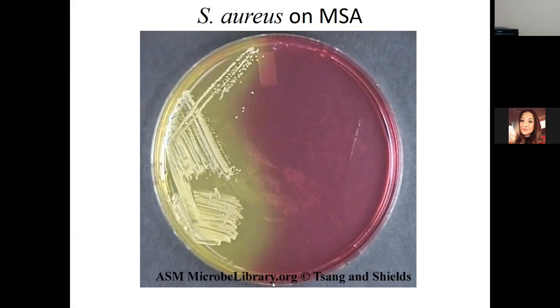Well, I got it out of the freezer and thawed it out, and then Zach and Emily streaked the plates for you today. No, this is a wound culture. It's probably a swab with bloody wound exudate on it, and they hand you that, and then you apply it to all these plates and streak for isolation, and then put them in the incubator for the night.